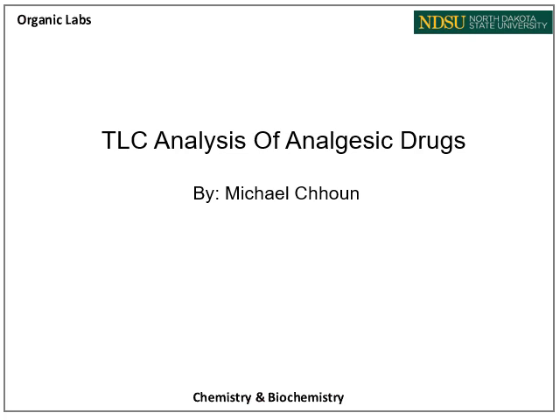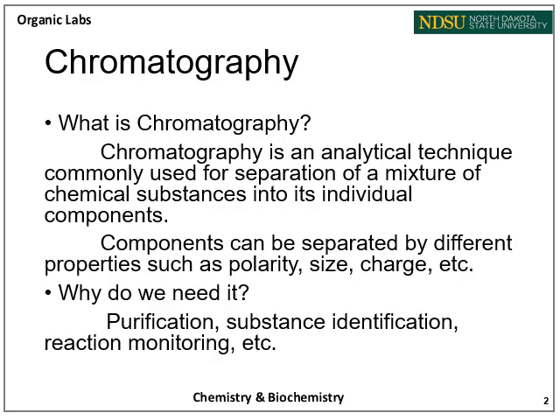Welcome to Organic 1 Lab, and today we will be performing thin layer chromatography for the analysis of analgesic drugs, or TLC for short. First, we're going to talk about chromatography and what it is used for.